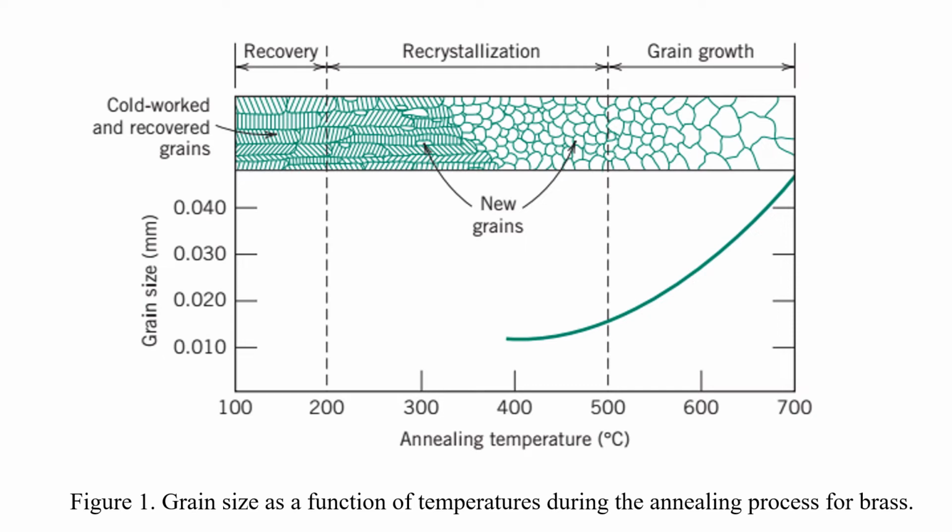Just remember that whenever we use the microscope, samples must be prepared before the experiment. So in this case, the sample surface must be ground and polished to a smooth and mirror-like finish. Then the microstructure is revealed by a surface treatment using an appropriate chemical reagent in a procedure termed etching. The reactivity of the grains depends on the crystallographic orientations. As a result, in a polycrystalline specimen, it varies from grain to grain as shown in figure 1.